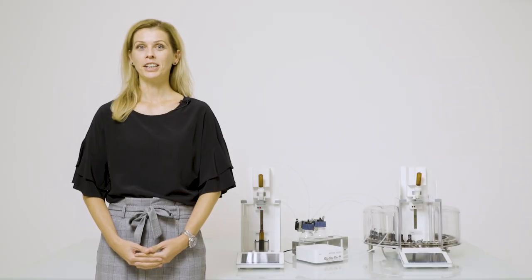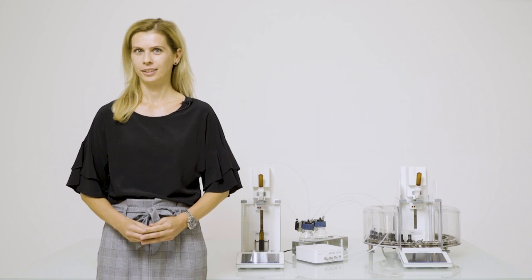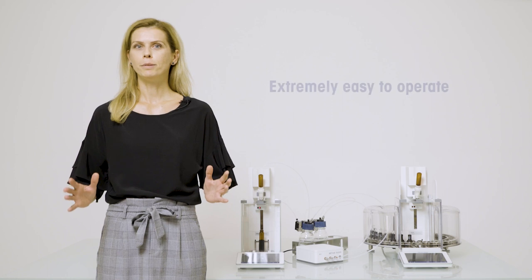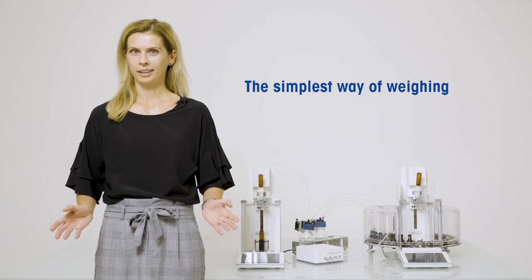Welcome to the presentation of the XPR Automatic Balance. Why is it an exciting product? XPR Automatic Balance is the world's first instrument that sets the new standard for weighing in the lab today and in the future. What is really exciting about it is that everybody can operate it without any special training. It is the simplest way of weighing. Watch our video and see how it's done.